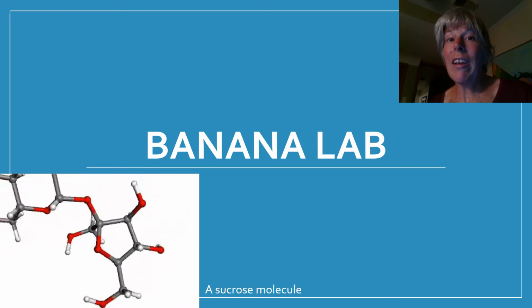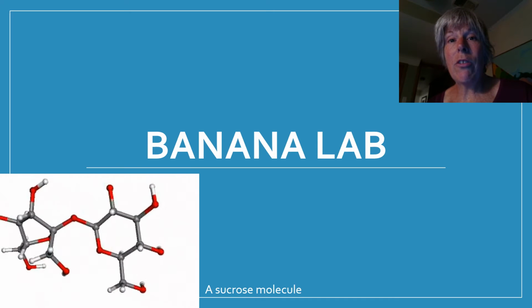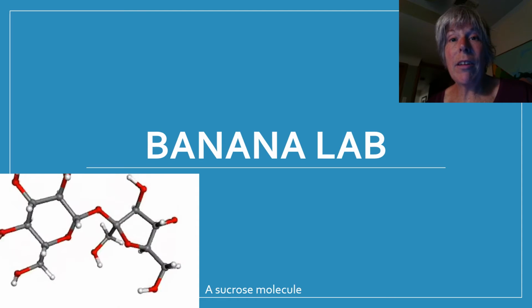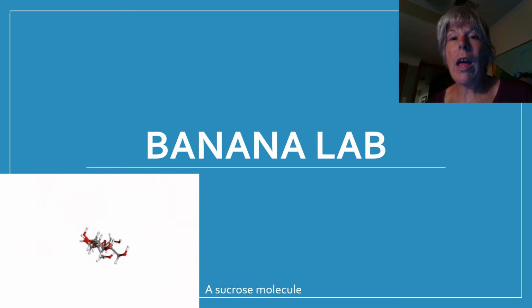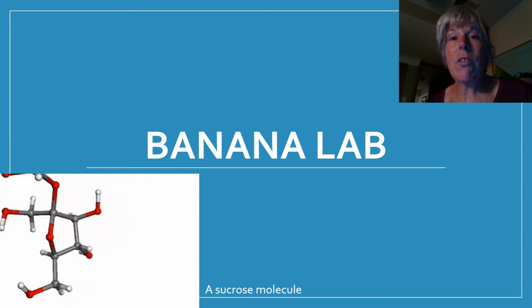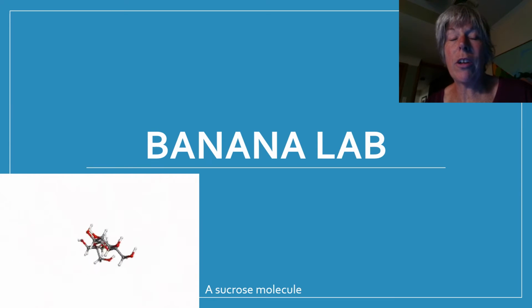Hi, this is the second of the Banana Lab videos. In the first video, I introduced you to the lab equipment and the type of techniques that you'll be doing in lab. In this video, what I want to do is show you some of the calculations that you'll need to do and also give you some of the drawings that you'll need to do on your handout in the pre-lab on the handout before you turn it in.